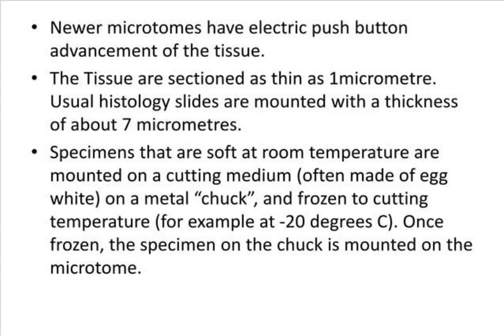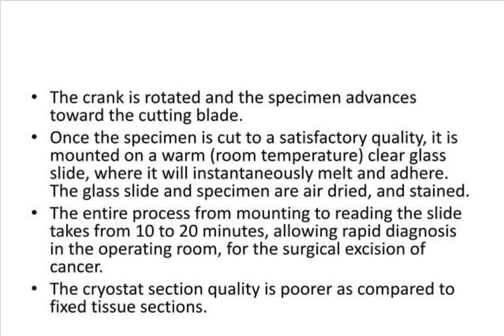As I said before, you will be maintaining the temperature at minus 20 degrees Celsius for freezing, and the frozen cutting temperature should be minus 20 degrees Celsius, so that the specimen on the chuck is mounted to the microtome. The crank is rotated and the specimen advances towards the cutting blade. This is mostly the methodology used for cutting the sections.